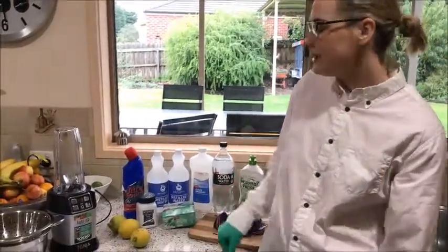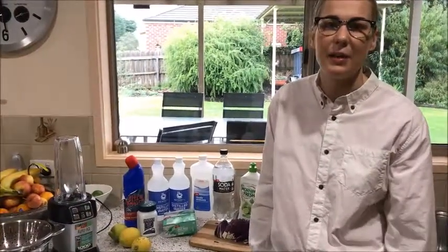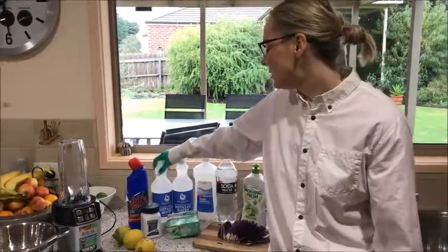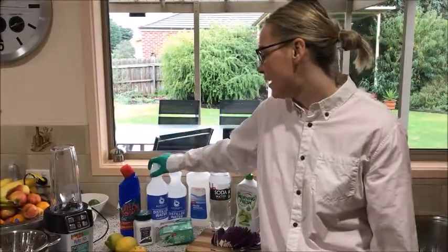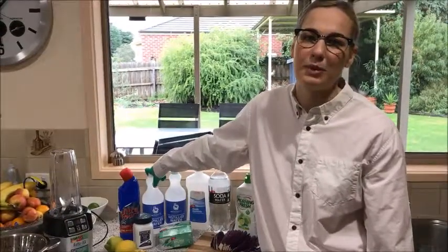Also, because this experiment is positively controlled, I don't want anything to interfere with the pH levels in the different containers. So we're using distilled water to mix with our pH indicator of the red cabbage, to try and have as much validity of this experiment as possible.